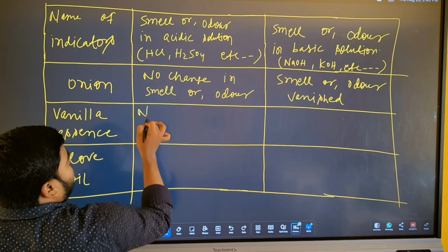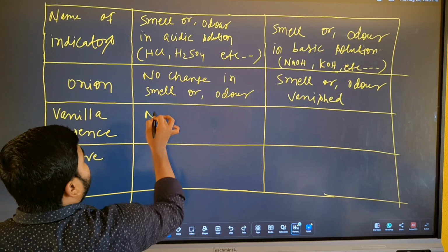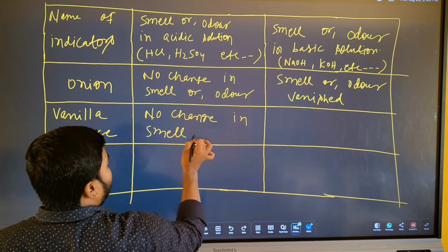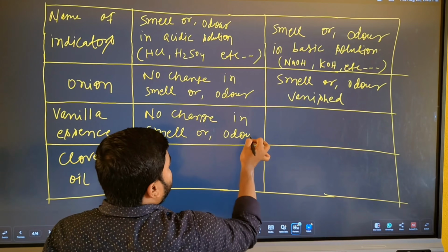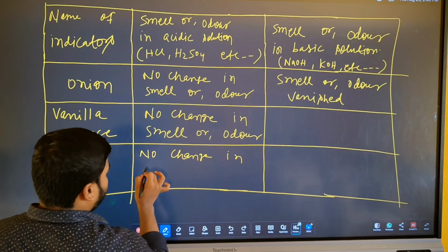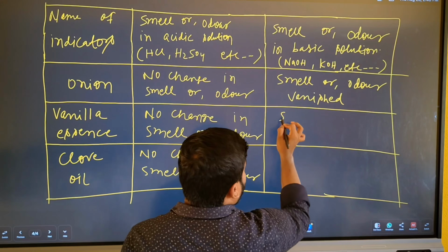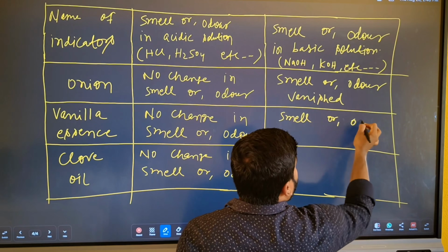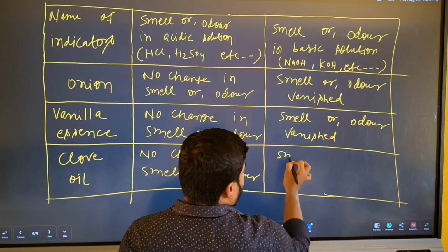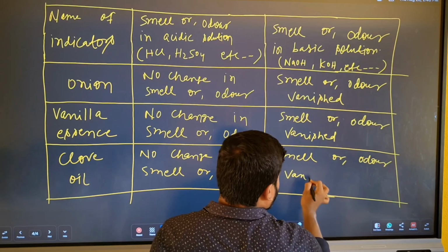Here also same thing, no change in smell or odor. Here also the same thing, smell or odor vanished. Smell or odor vanished.